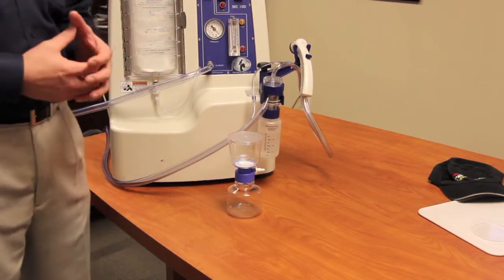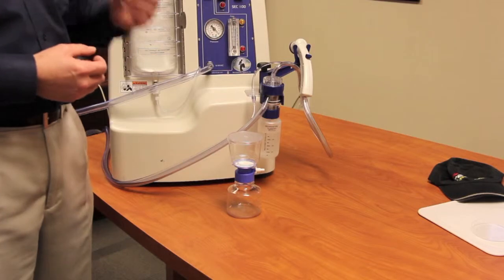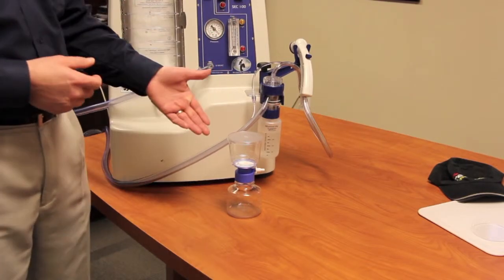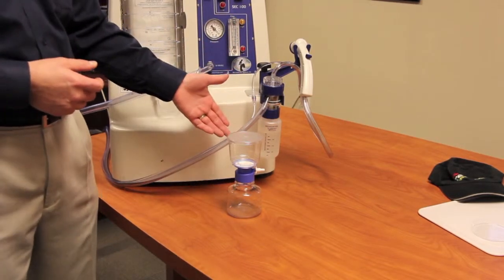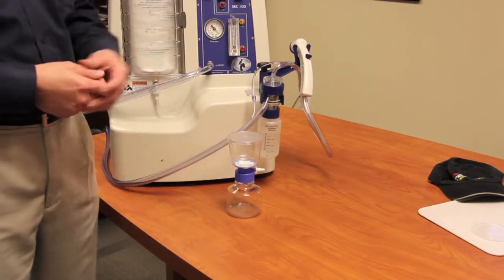Okay, so now we're going to talk about actually filtering the sample and concentrating it and getting it ready to send over to the lab. So you have a filter apparatus here, and you also have the M-Vac in its holder, and as you can see, it still has the sampling bottle on it, and it's now full of the solution and the DNA material.